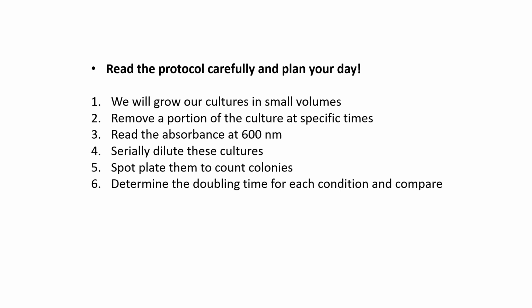Now, definitely want to look over the protocol, read it carefully, because this experiment is not hard, but it takes some prep to really get it going smoothly. So you're going to grow your cultures, and we're going to do small volumes. It's all written out nicely in the lab manual. You're going to take portions out at specific times. You're going to read the absorbance for them each time.